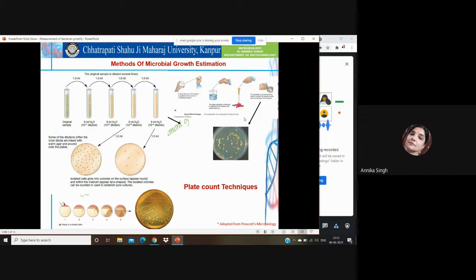One reason for this is that plate counts are not helpful if the microbes cannot be cultured on solid medium, or if large colonies overgrow the surface of the plate, which actually happens with soil bacteria.